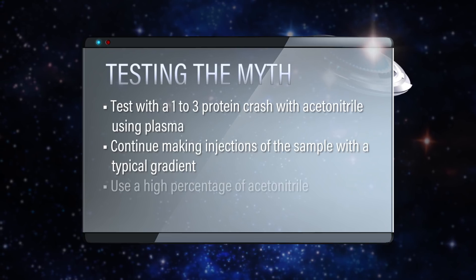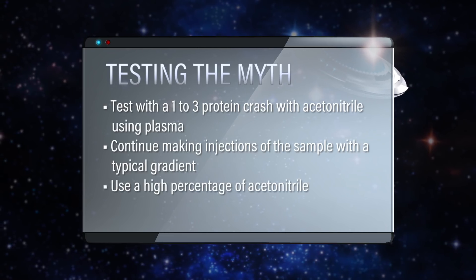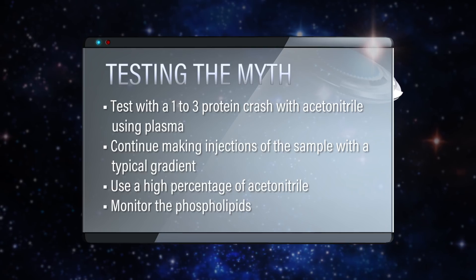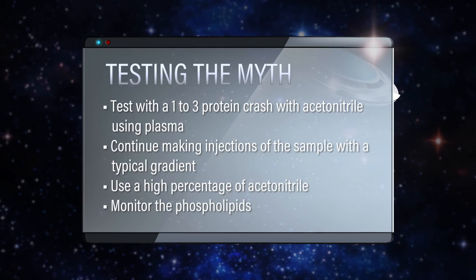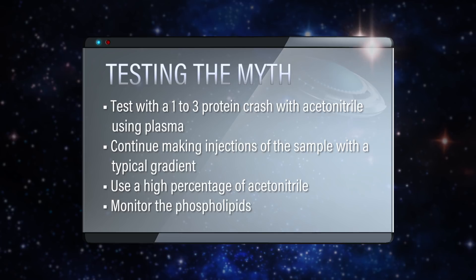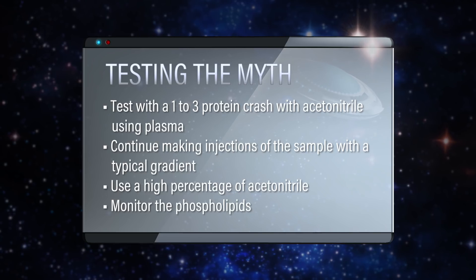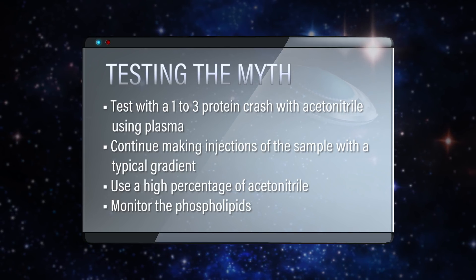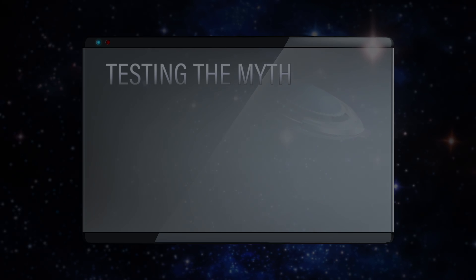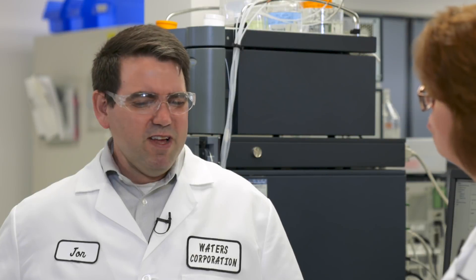We'll just keep making injections of this sample over and over again with a typical gradient used in bioanalysis, going to a high percentage of acetonitrile to potentially wash off the column. We'll monitor the phospholipids, since they're the major cause of matrix effects, and monitor the area count to see if it fluctuates.